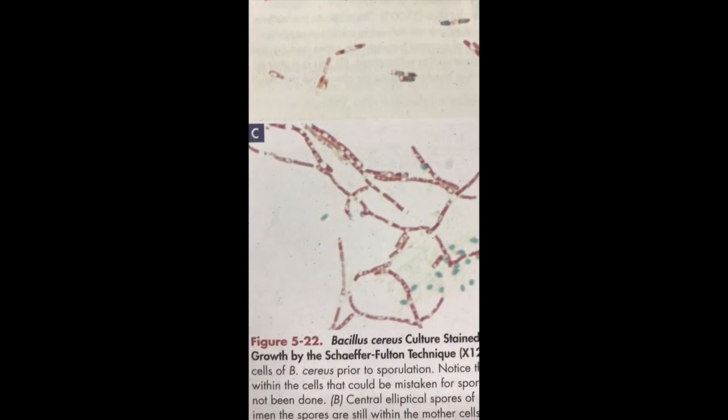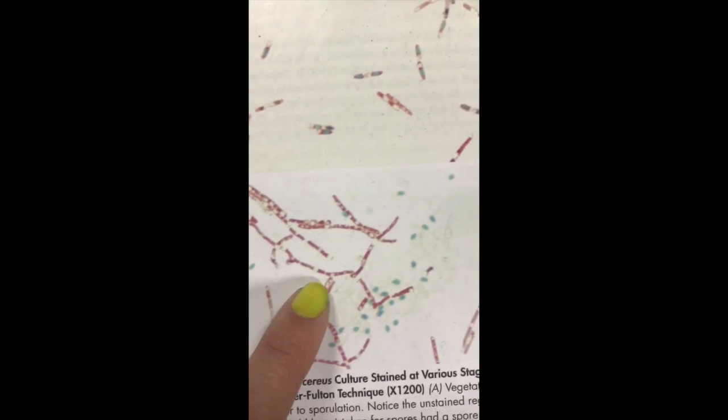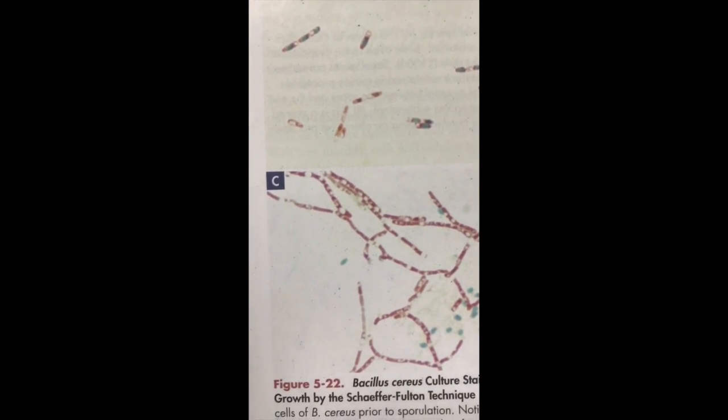And C, notice that this is spores forming here, there and there. And these are visible spores.